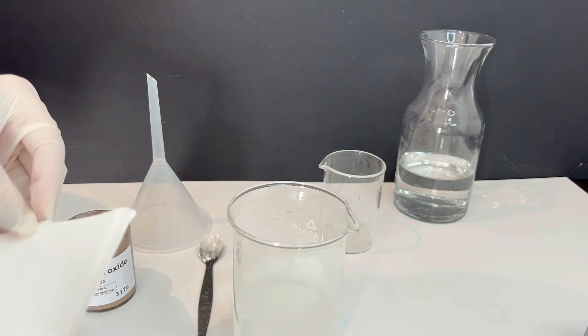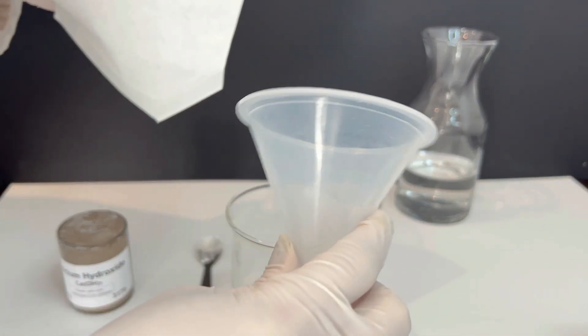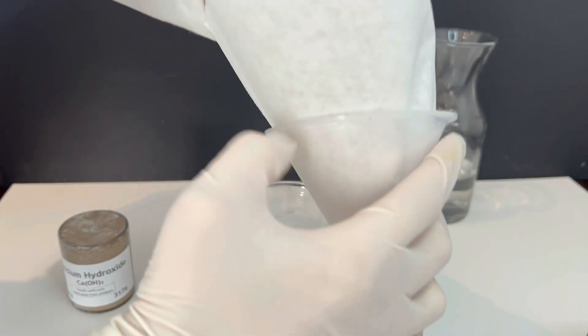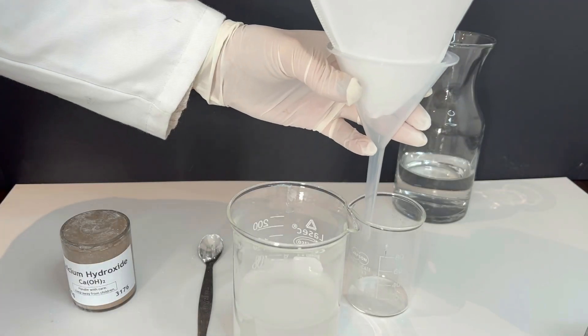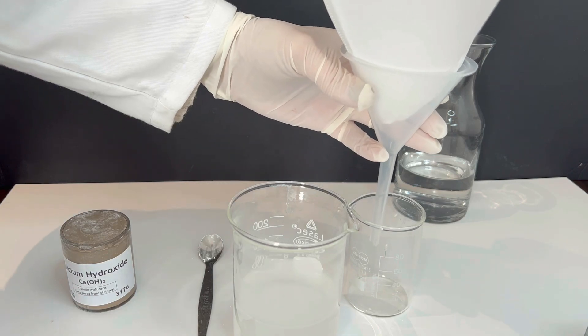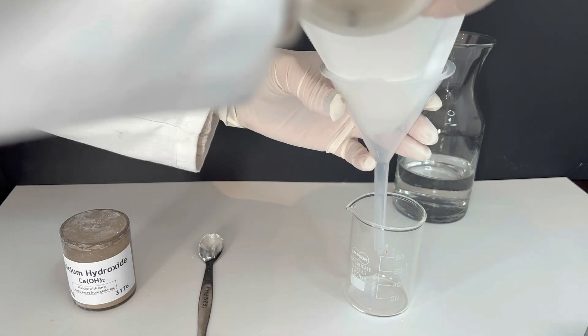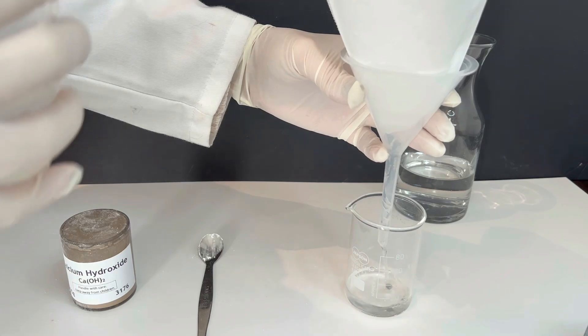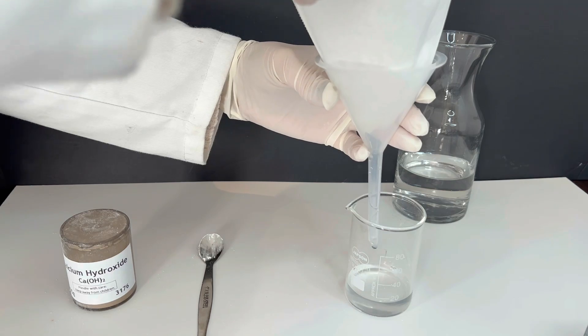Now we'll filter the solution. Place filter paper inside a funnel and position the funnel over a clean beaker or container. Gently pour the clear liquid through the filter. This separates the dissolved calcium hydroxide solution from the undissolved particles.